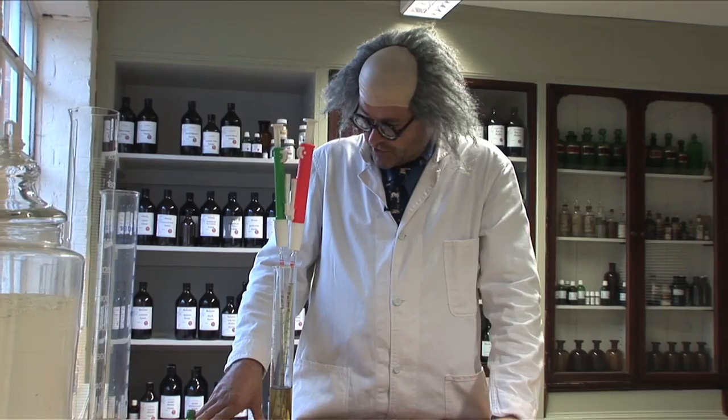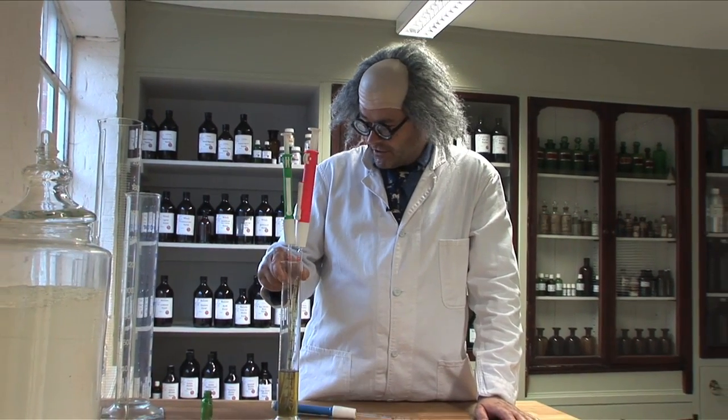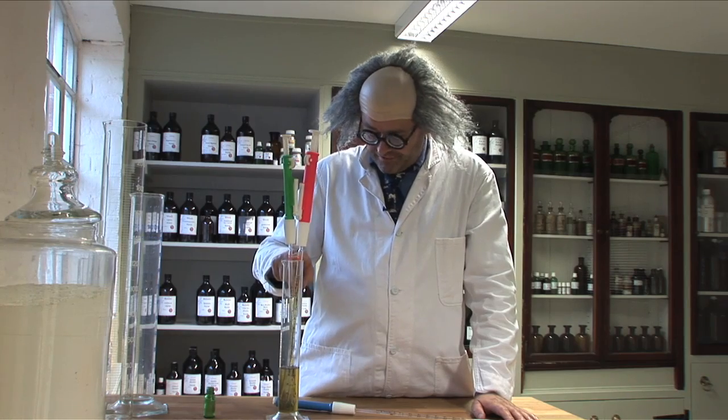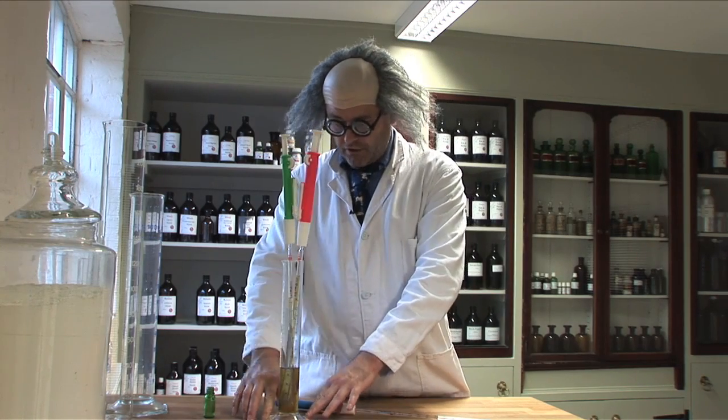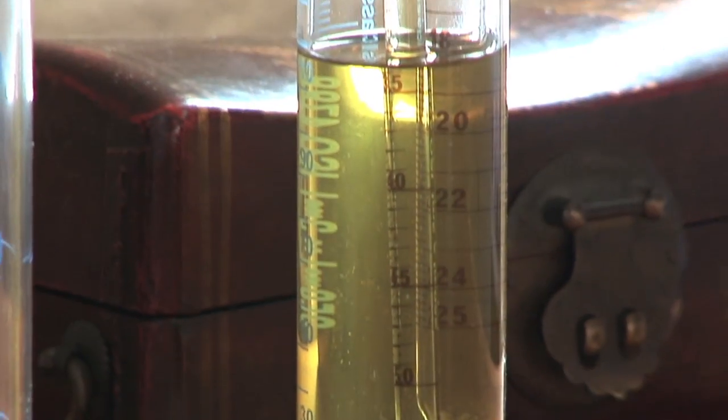25 mils would be the largest pipette I'd ever use, and after that I would go into cylinders. This is a 250 mil cylinder — it's quite stable. I keep alcohol in there and I keep the pipettes charged with alcohol, which also keeps them clean.